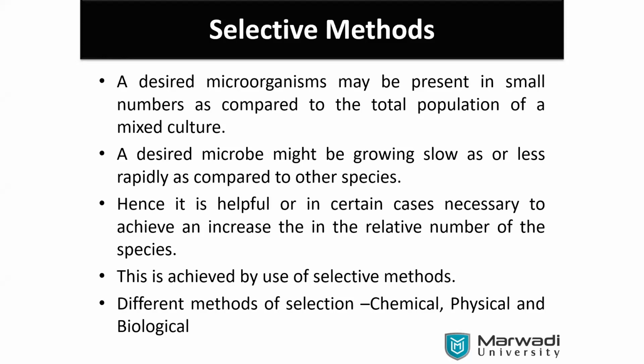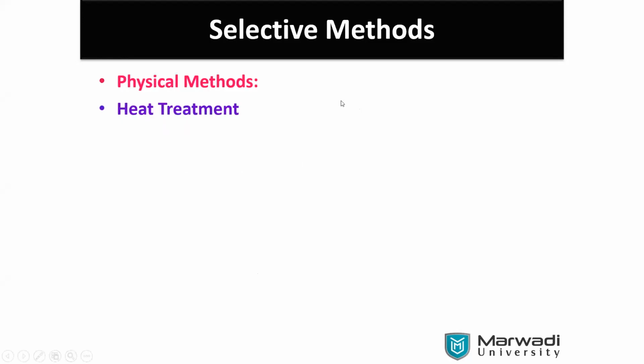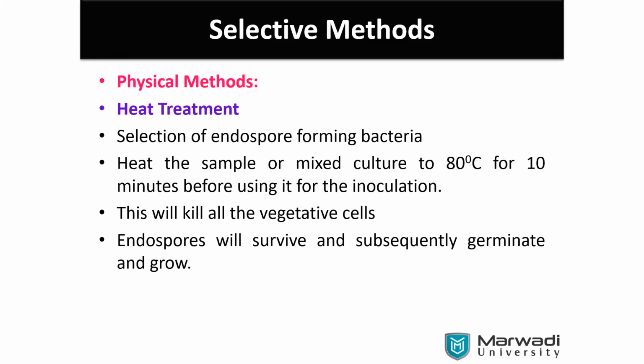Okay, so it is the selections. It is based just on the plate. But when you are looking for this, we are going to have three other major aspects: physical, chemical, and biological. The first method is physical methods. Physical method, that is endospore formation.